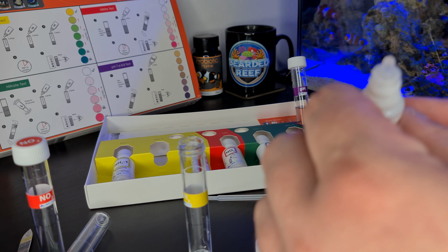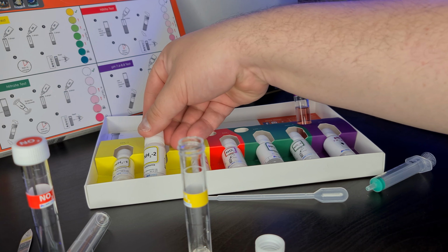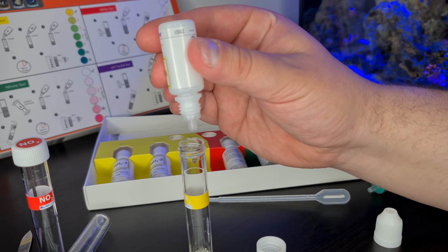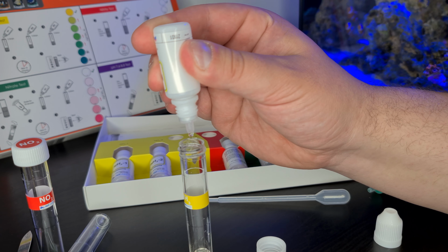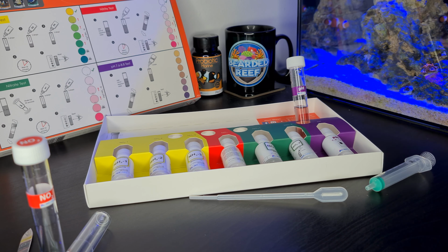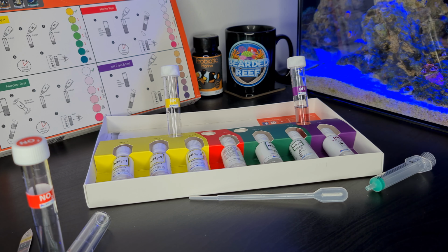Number one. This is number two. I'll get 5 drops of that. I think that's maybe a bit too much, I don't know. It kind of came out a bit quick there, but I think that's 5 drops of that. And then we'll give 5 drops of this. Okay, so that's 5 drops in there. And it says do the inversion on this, so I'm just going to invert this a few times. And then leave it for 10 minutes. So I'll leave that one for 10 minutes and we'll come back and check the results.